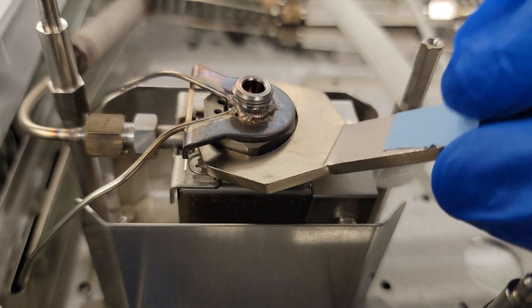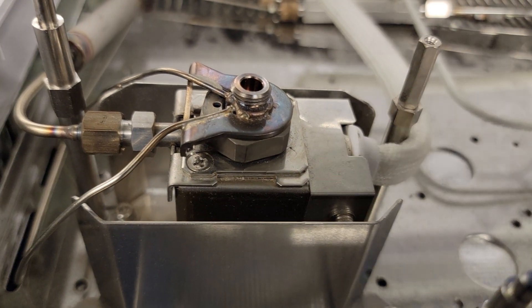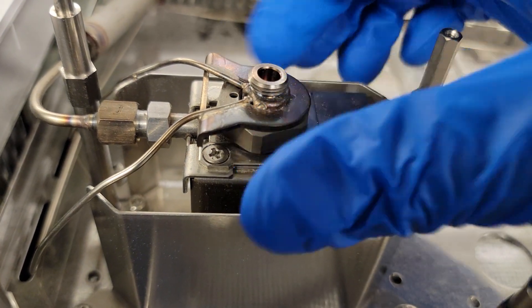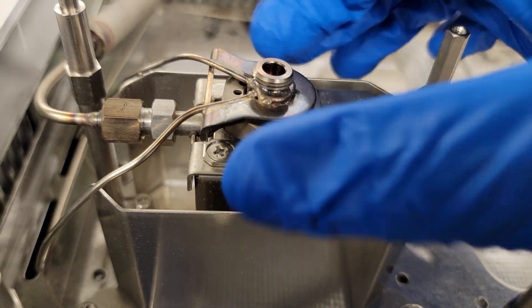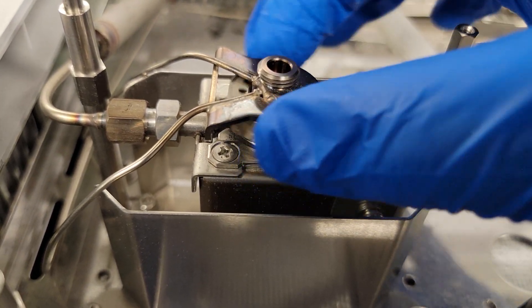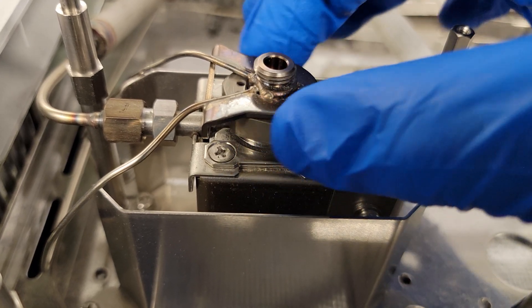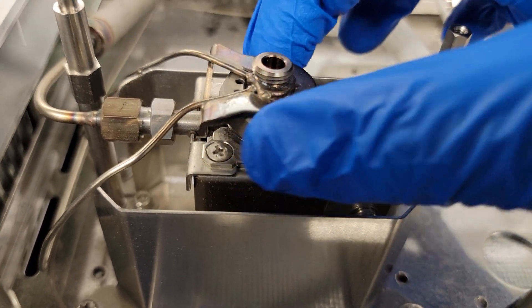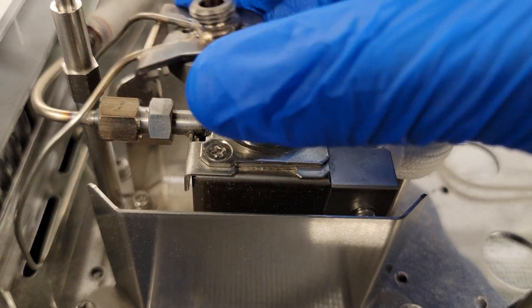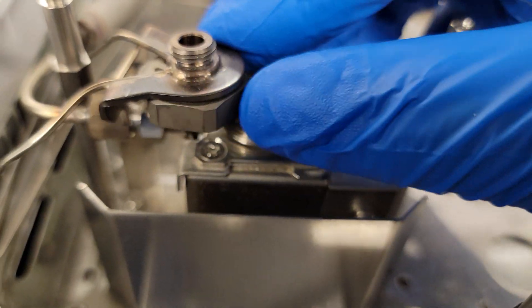We're going to loosen this up. It should be pretty easy - you shouldn't put it on too tight. Then it can just loosen by hand. This is all going to be connected to this piece up here, so the whole thing can just set to the side.